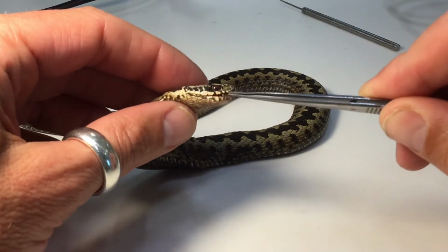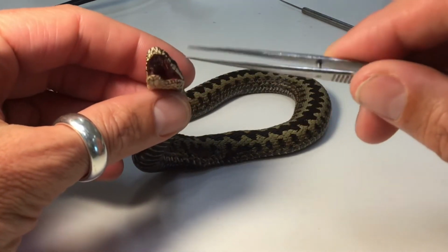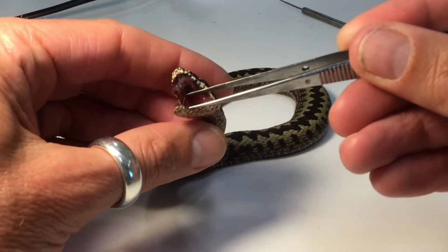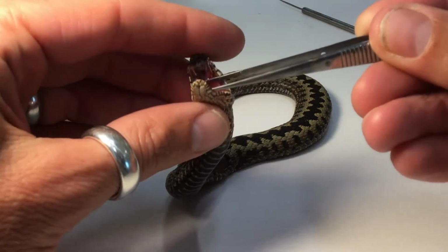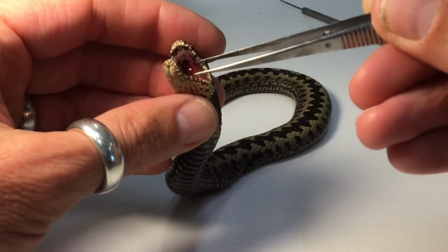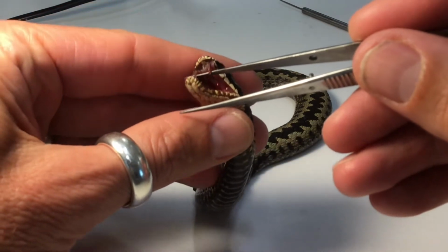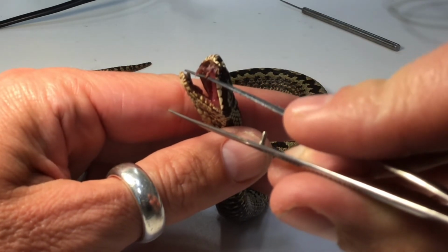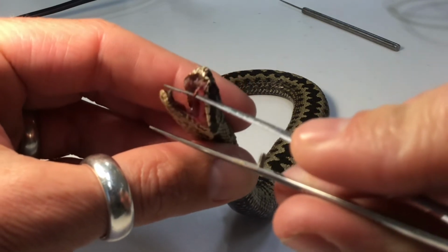I'm just going to open his mouth here and see, hopefully I can show you the fangs, which will inject that venom. So if I just open the mouth like so, and hopefully hook my forceps behind the fangs, like so, you should, I hope, just be able to see the fangs there. Just coming over the edge of my forceps, you can see the fangs which would inject the venom.